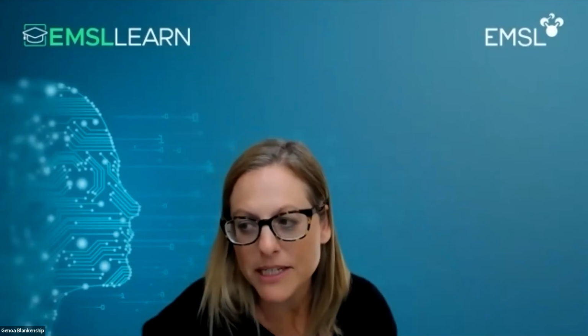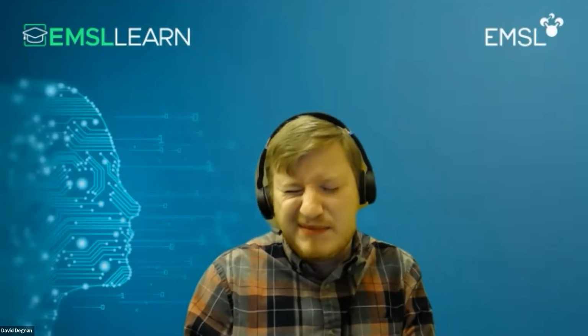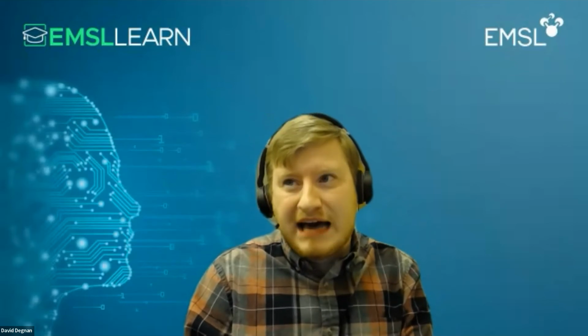All right, David, what are the updates being made to the PSpecteR app and package? Yeah, the updates currently are, first, to support faster searching in general for proteoforms downstream. The original algorithm was just a tiny bit slower, so you can optimize the fragments you pick before you do the matching, and that was added.